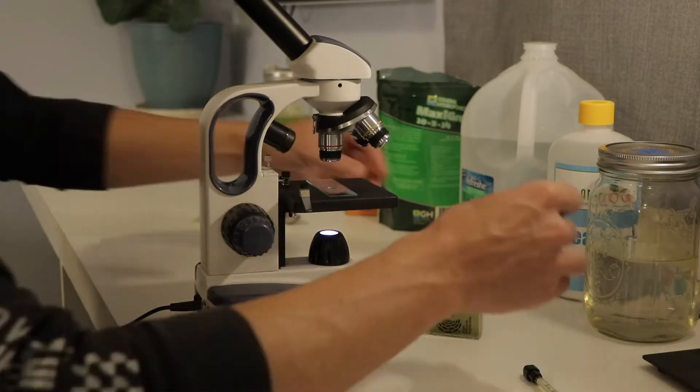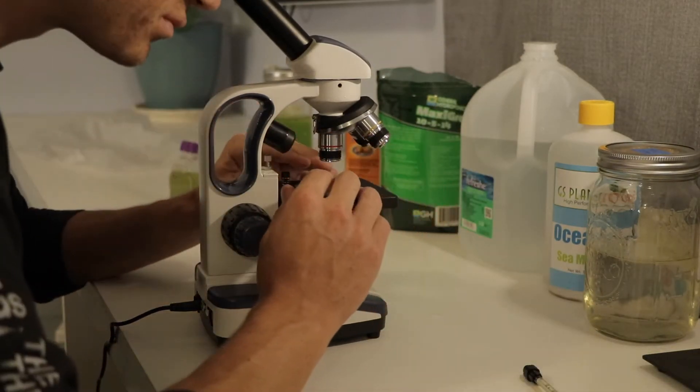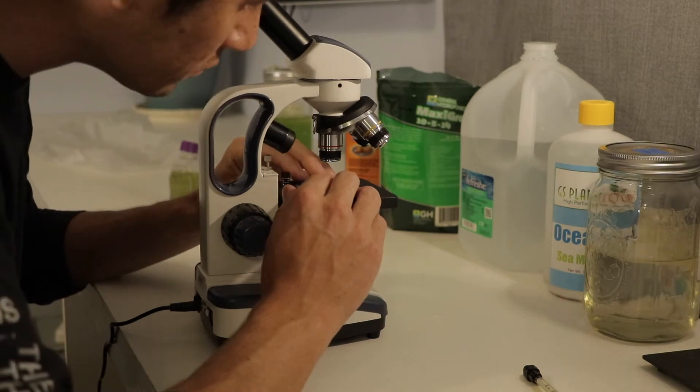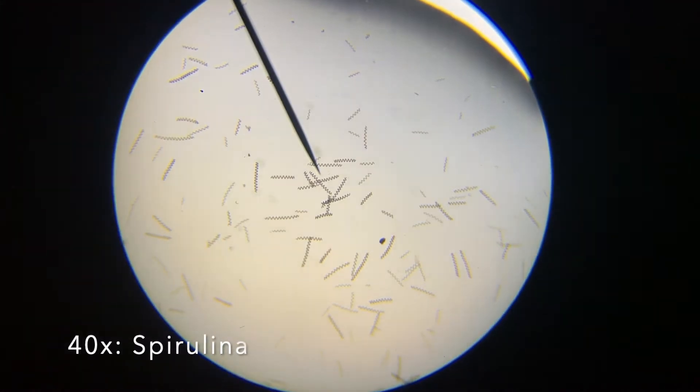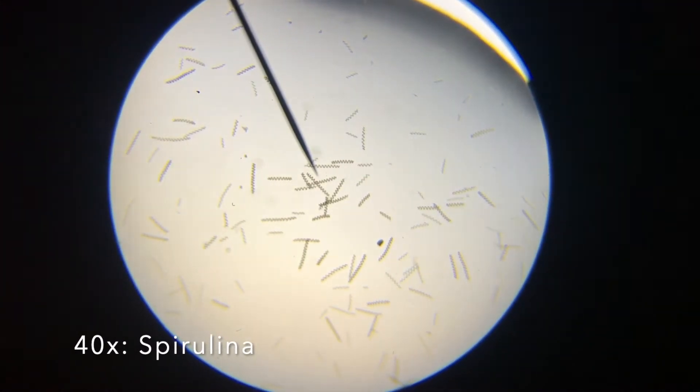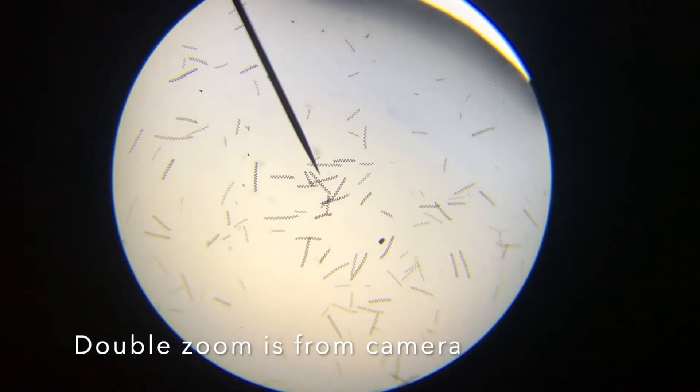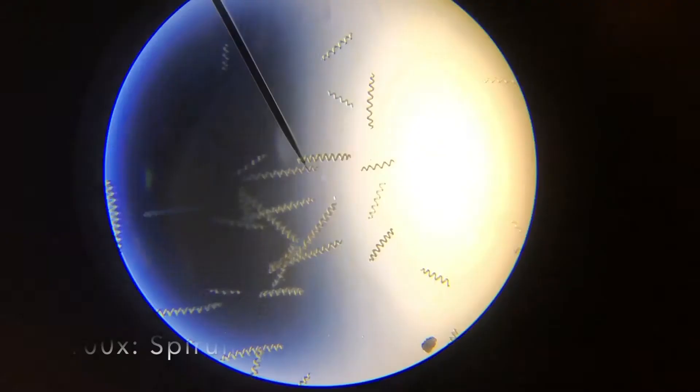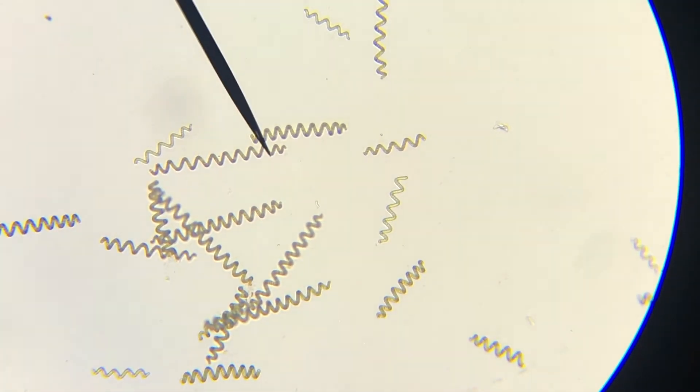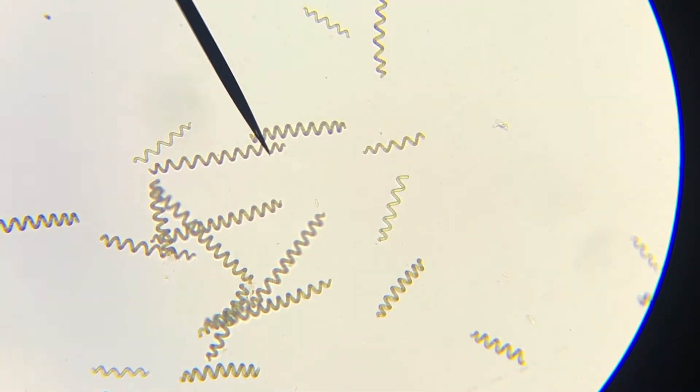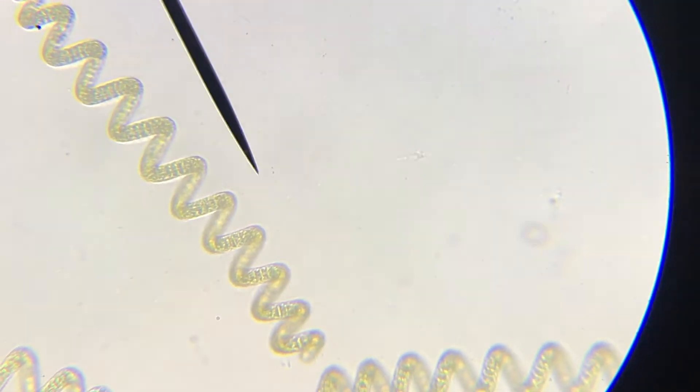Now we're getting to the good stuff. So I check my 40 milliliters of spirulina algae under the microscope. I'm looking at them at magnifications of 40x, 100x, and 400x. And they all look really great. I don't see any contaminants, nothing in there other than algae. The algae looks more coiled. It's longer. It is a little bit more brown than I initially remember, but overall they look good.